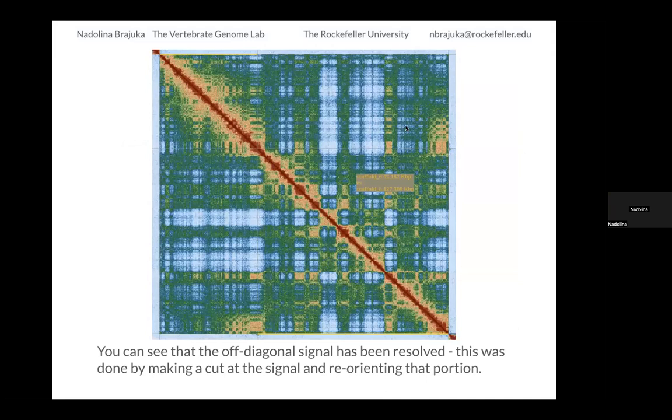Okay. Yeah, and so this is just showing that it's been resolved. And I'll show you how you can do something like that in pretext view.